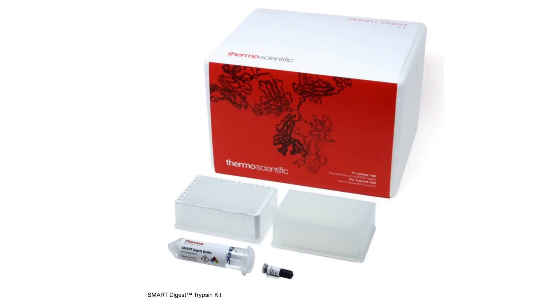The kit itself contains only three components: the immobilised enzyme, the optimised Smart Digest buffer, and a collection plate — meaning everything you need for your digestion is ready in the kit.